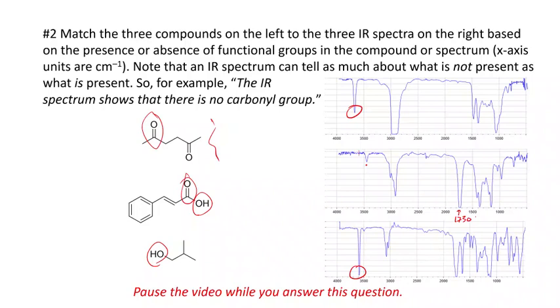Okay? And if you multiply that by 2, that's 3460. And if you look right here, this absorption is 3460. What that is, what we call a harmonic. So we're going from the ground state to the first vibrational level at 1730. But there's another level that you can go to, the second excited state, and that's the 3460.